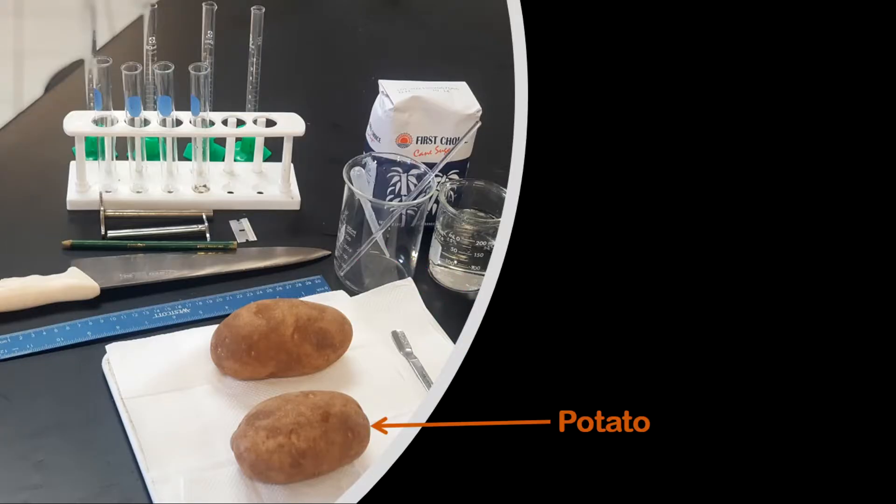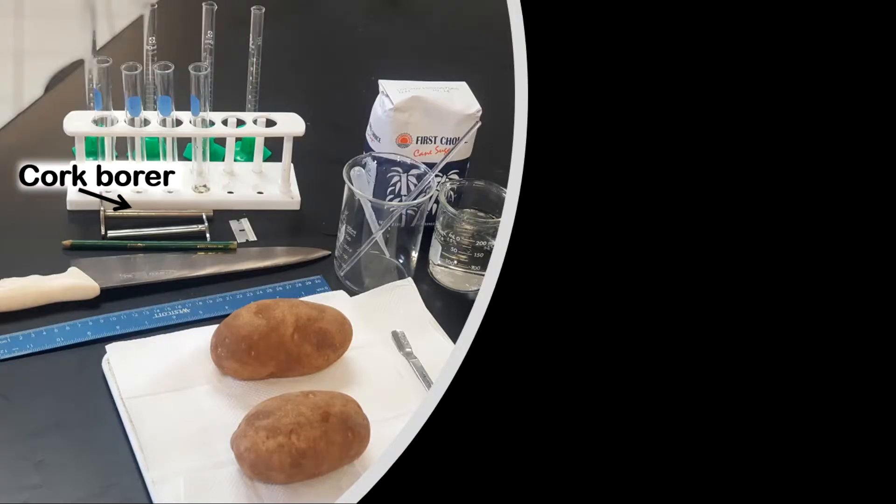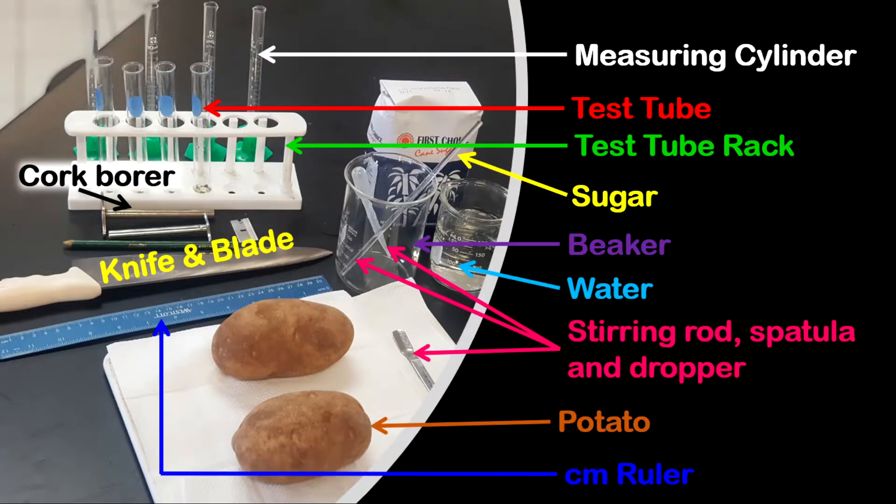You need a large or medium-sized potato — I have two potatoes because in experiments things could go wrong, so I like to have extra just in case. You also need a centimeter ruler, a cork borer which is very important for this experiment, and something to cut with — a knife and a blade. Now take a quick note of all the apparatus needed for this experiment.